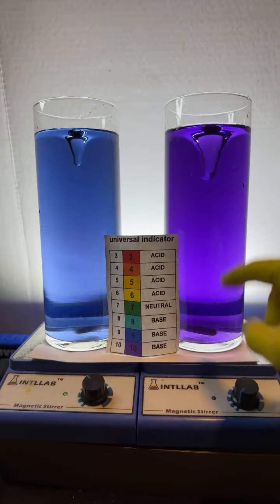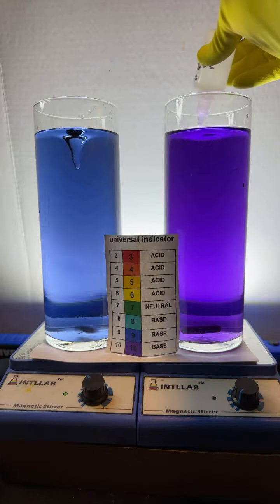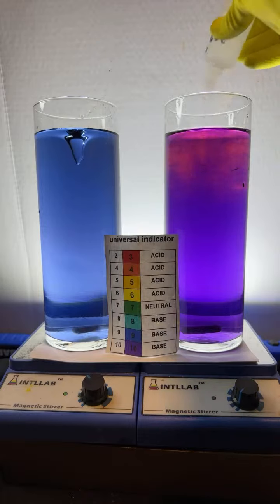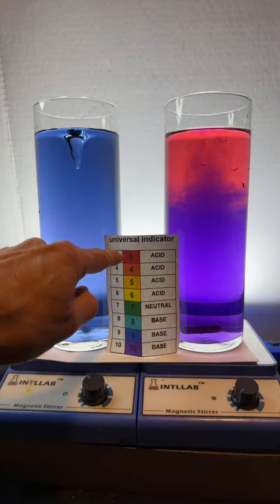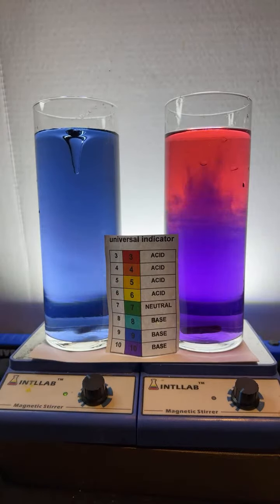I'm going to go ahead and turn the stir bar off over here and then add in a bunch of acid. So the acid I'm adding up here at the top is hydrochloric acid, the same acid that's found in your stomach. You can see now we have a pH of 3 at the top, but a pH of 10 at the bottom. And this is really interesting.